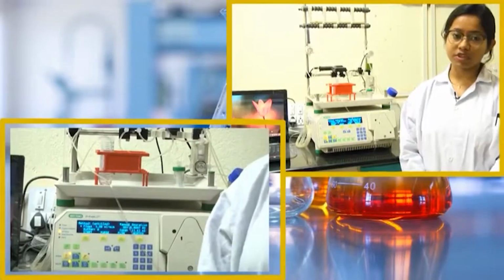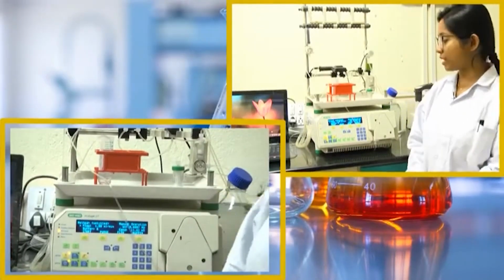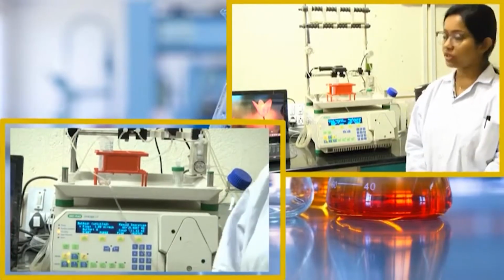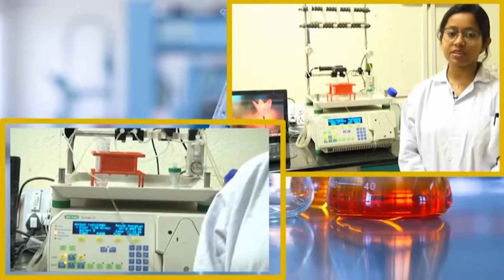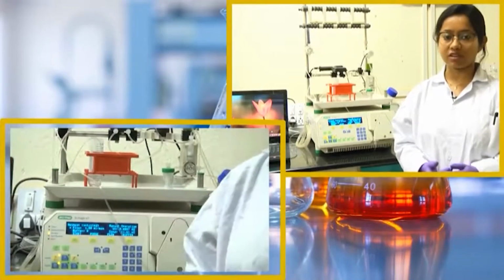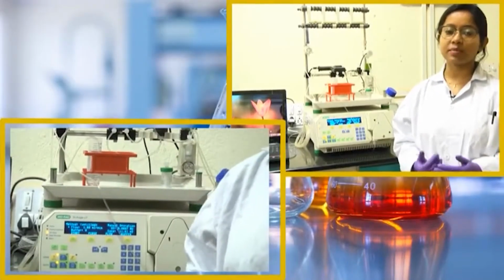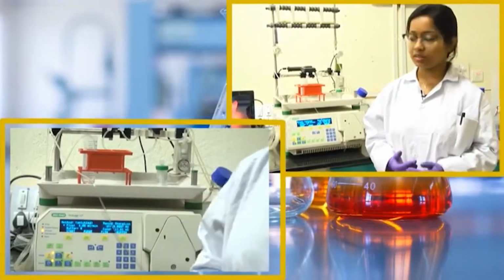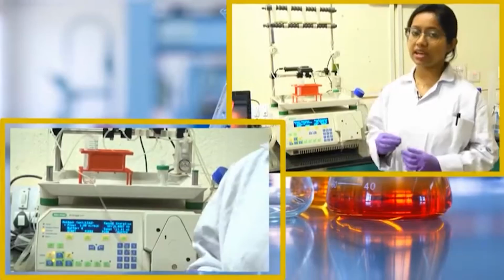While the centrifugation is happening, we will make the preparation for our next step. In our case our protein is 6x histidine tagged. It has 6 consecutive histidine molecules at the N terminal of the protein. So, we can easily separate that protein from other cellular components or other proteins. We will use the Ni-NTA column.